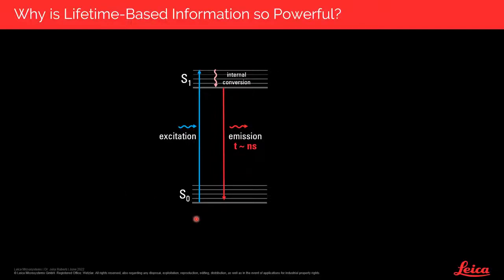the excitation and the emission process when molecules are excited from the ground state to an excited state, and then they will get rid of this energy that we have given them through the emission of a photon when we have fluorescence.